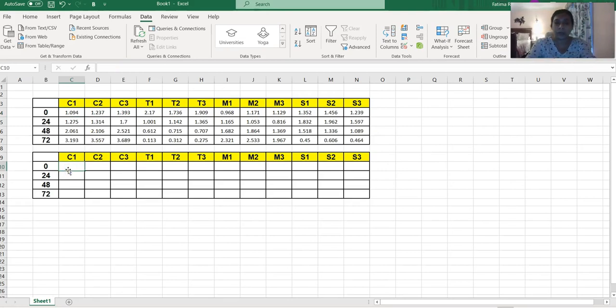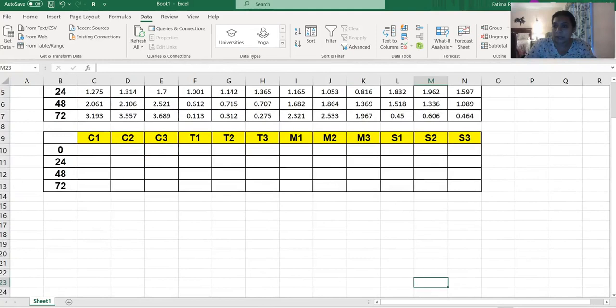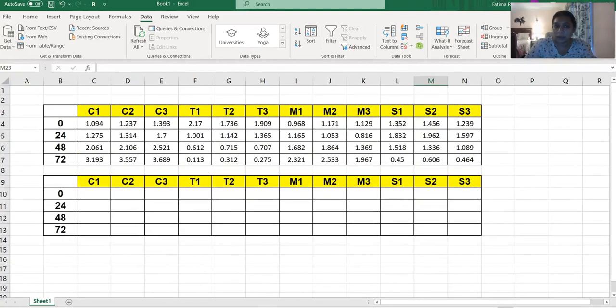So when we do that, we can do that using a formula. So I'm going to write equal sign, and then I'm going to make it a little bit bigger so it's maybe a little bit easier to see. Okay, right there. So equal sign, and I'm going to take my first number and divide it by itself.